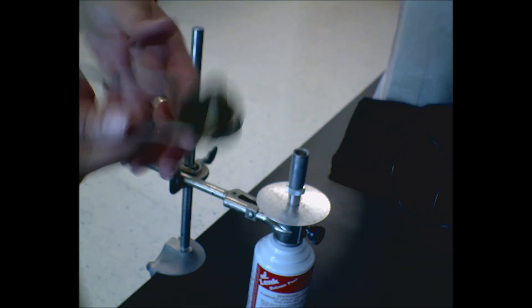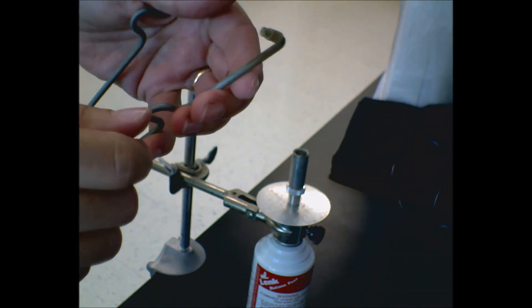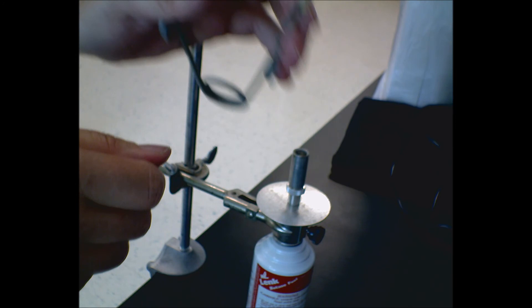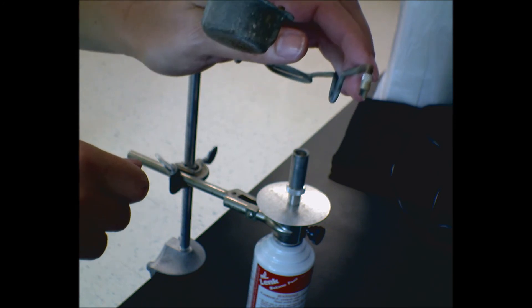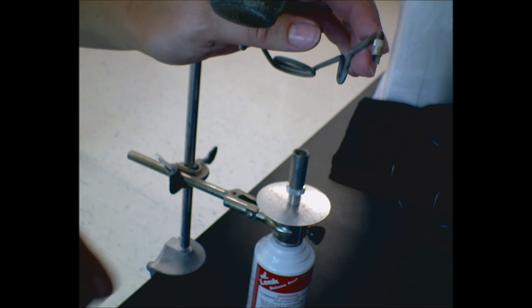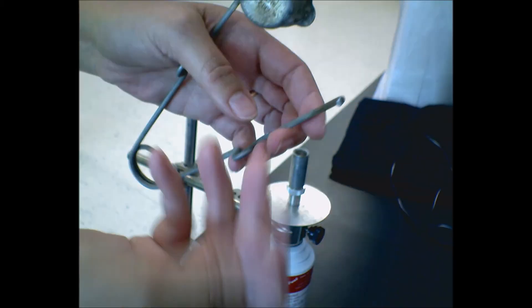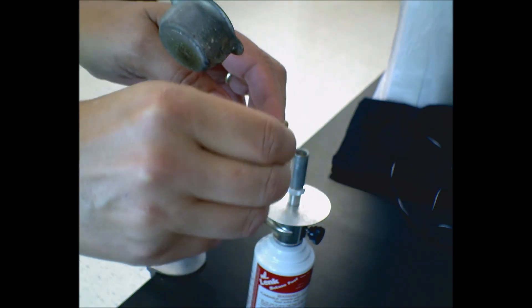I'm going to use this. This is a striker. There is a piece of flint on there. If you ever read Hatchet, the kid found a piece of flint rock and he used it to make sparks and start fire. When the flint wears out, these can be replaced and you put a new one on.